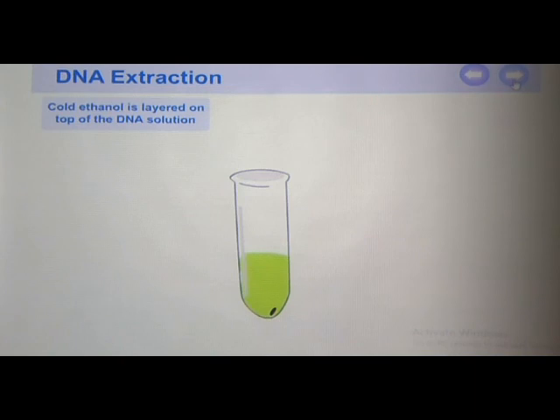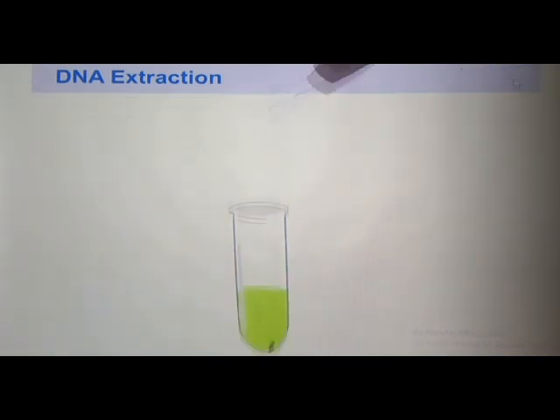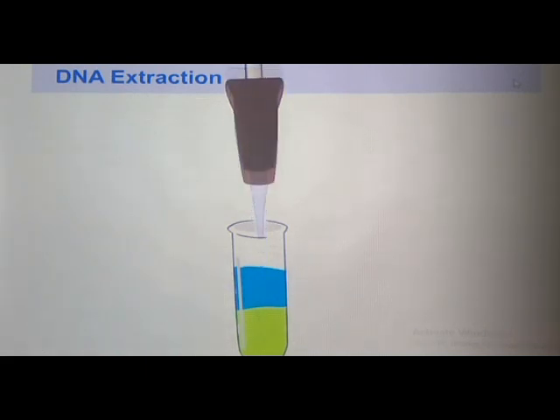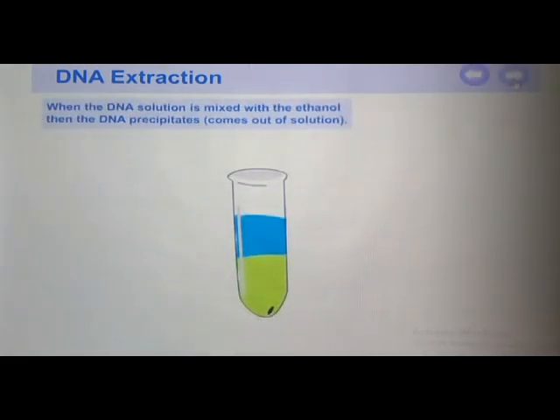Cold ethanol is layered on top of the DNA solution. When the DNA solution is mixed with ethanol, the DNA precipitates and comes out of solution.